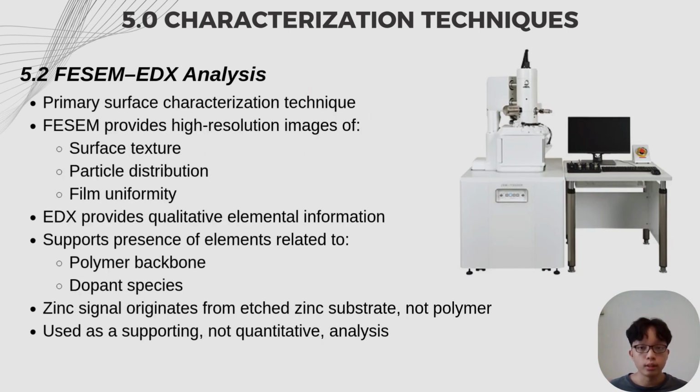FESEM and EDX were used to analyze the surface morphology and elemental composition of polyaniline emeraldine salt. FESEM provides high-resolution images of surface texture, particle distribution, and film uniformity, while EDX gives qualitative elemental information related to the polymer and dopant species. Any zinc detected originates from the substrate and not the polymer itself.